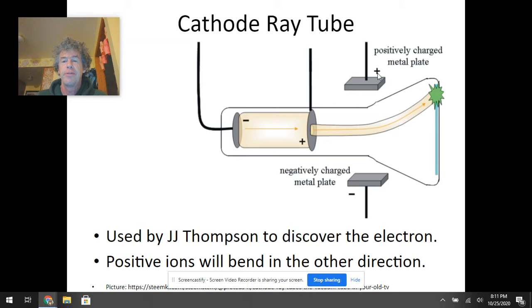it's running through here, and it runs through this field where there's a plus charge on this side and a minus charge on this side, and you're basically shooting negatively charged particles. And since negative is attracted to positive, the positive here causes the particle to curl towards the positive. Now, there's two things that will make it curl more.